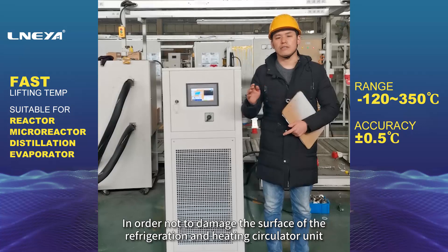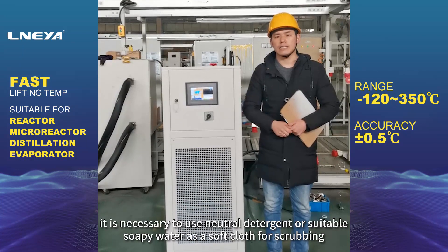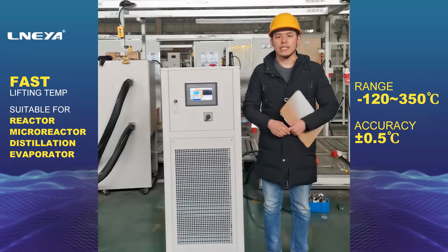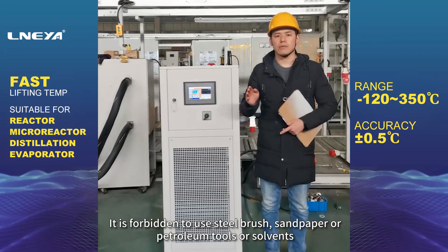To clean the surface of the refrigeration and heating circulator unit without damaging it, use neutral detergent or suitable soapy water with a soft cloth for scrubbing. It is forbidden to use steel brushes, sandpaper, petroleum-based tools, or solvents.